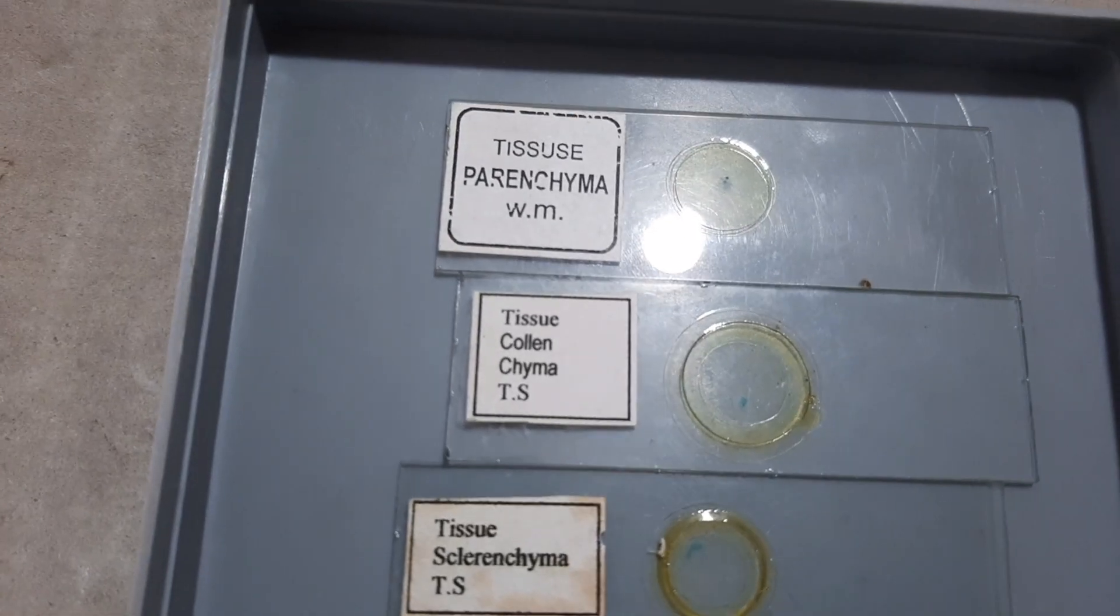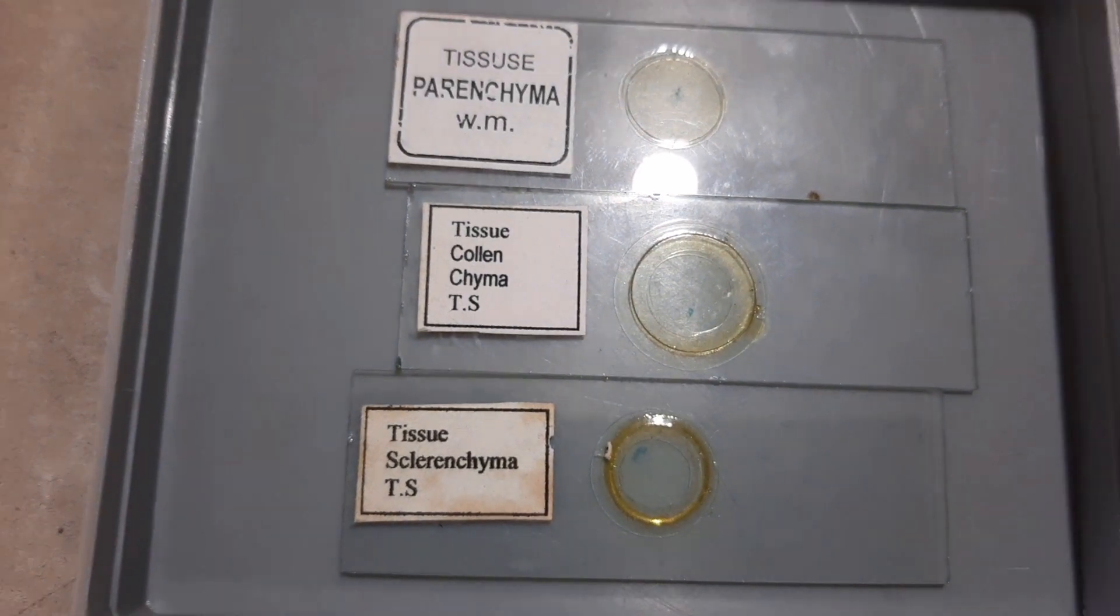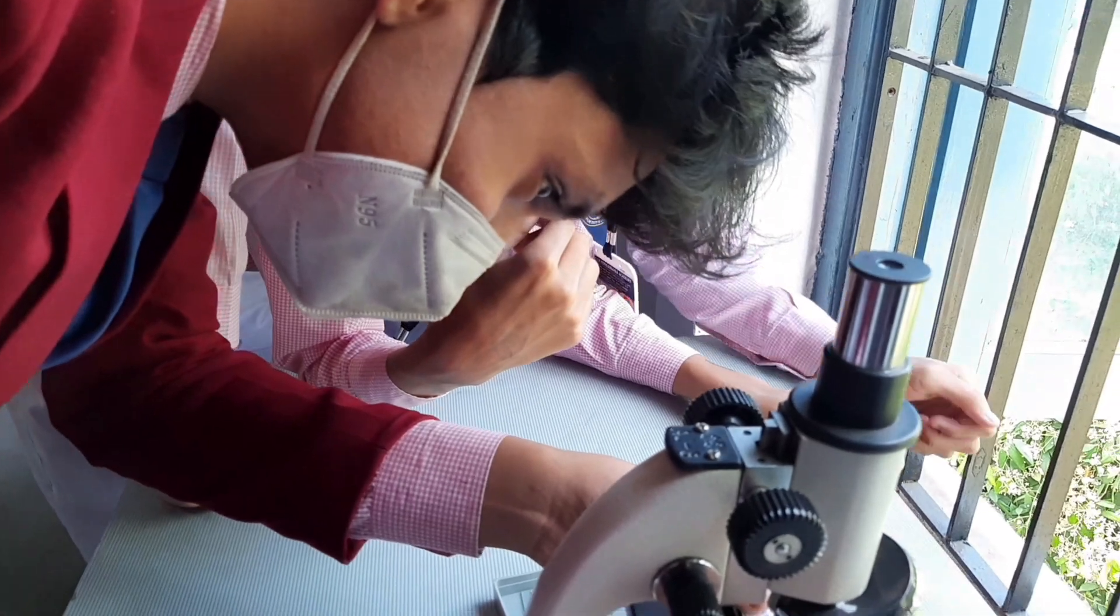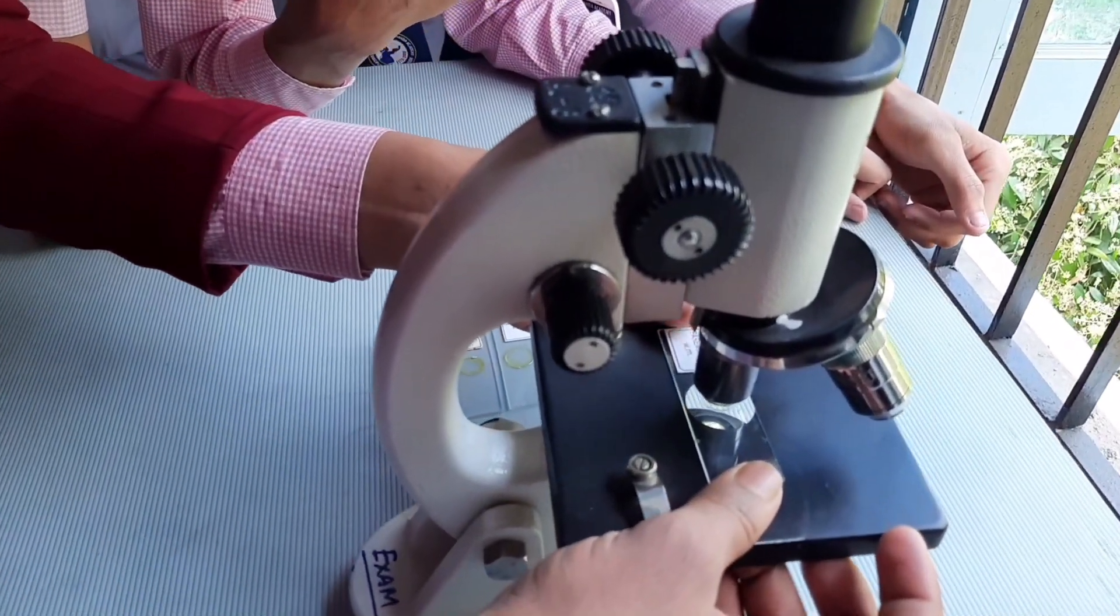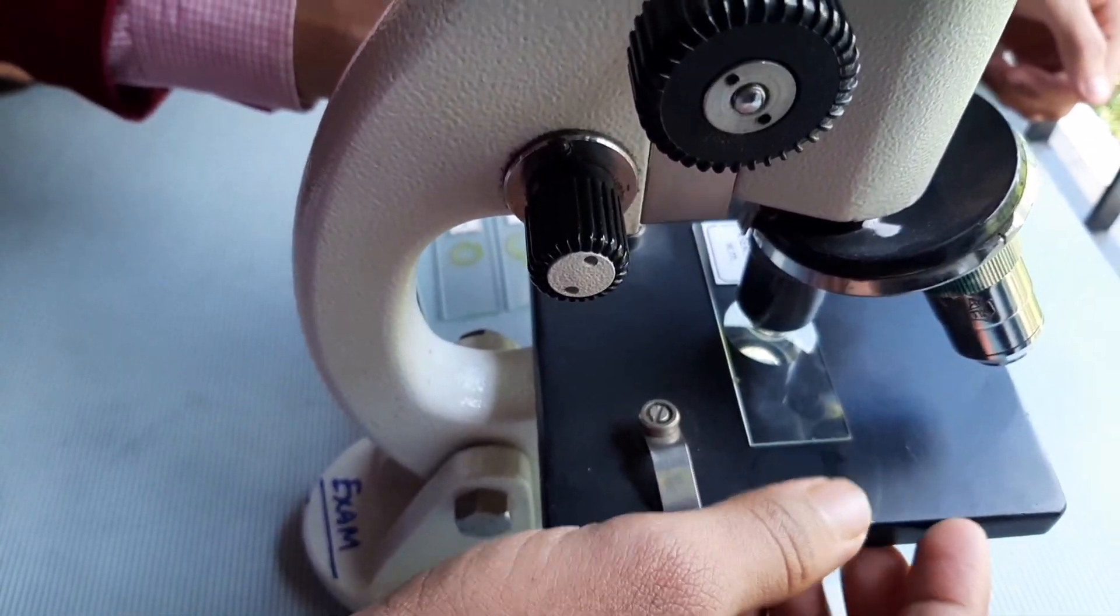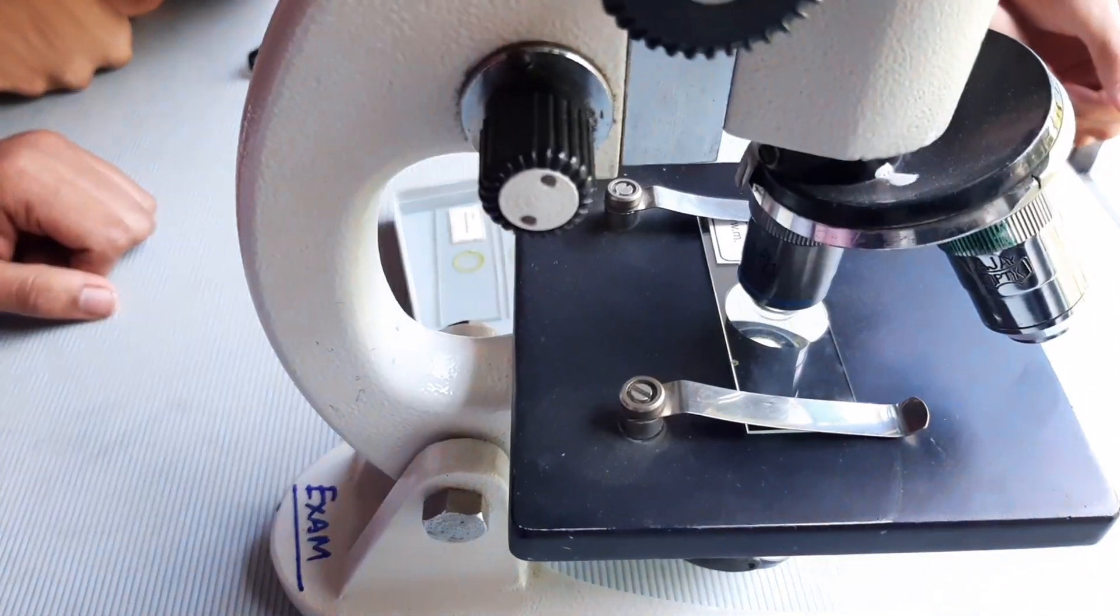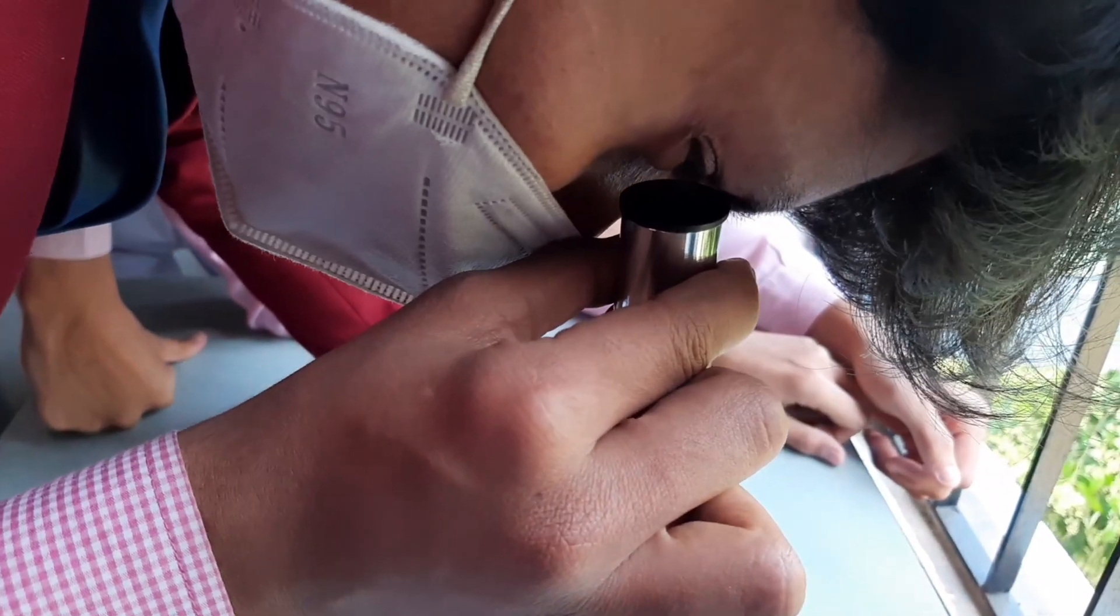you have to draw labeled diagrams and write down comments for the characteristics that you have seen. You can see here my student is fixing the slide on the stage of the microscope, and then he will view it and note down the features.